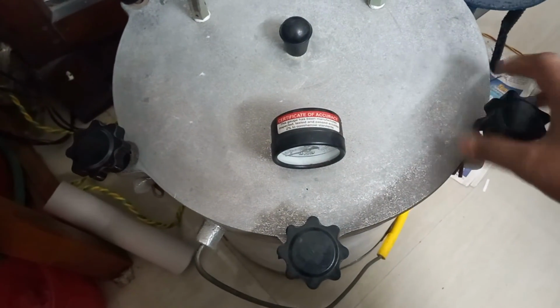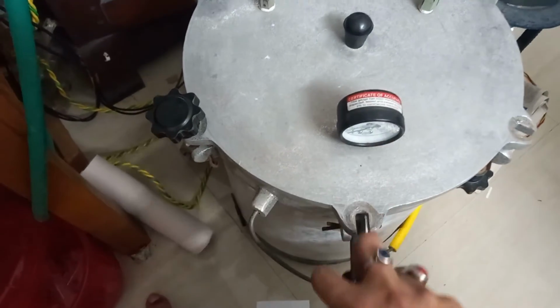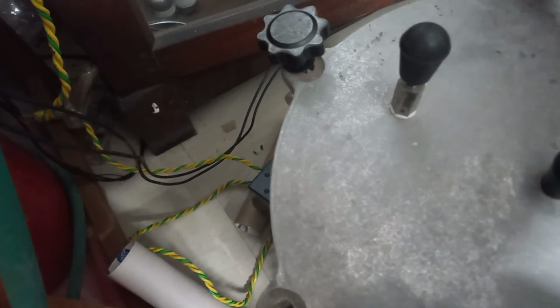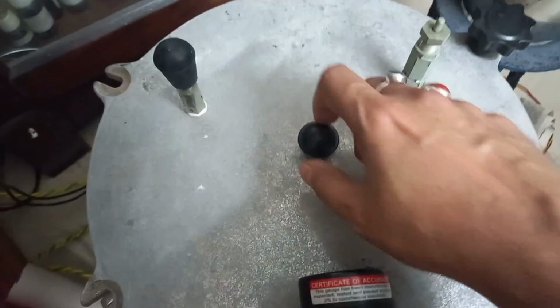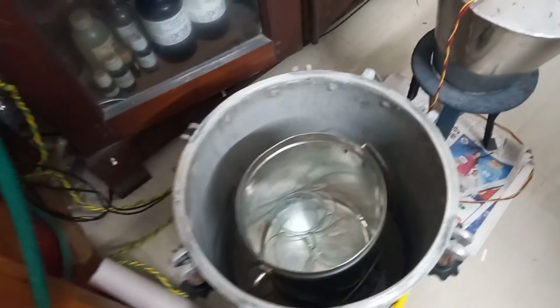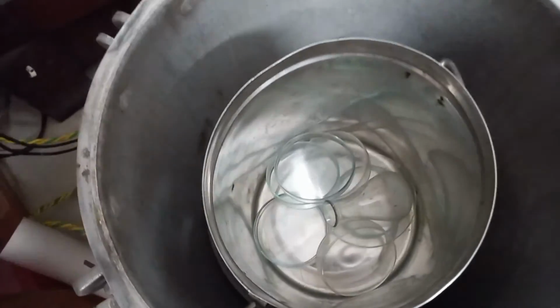So now we are going to remove the top cover. Just before setting up the autoclave, we have to take off the cover. This is the handle. I am taking off the cover, and you can see what is inside. This is the chamber.